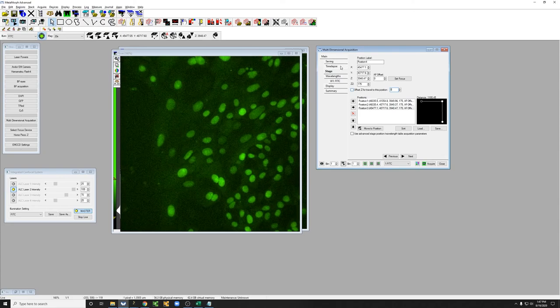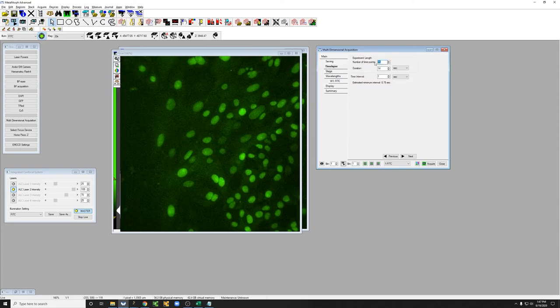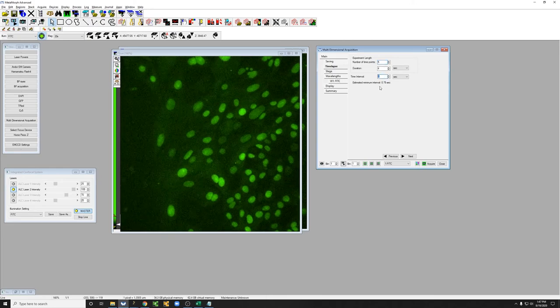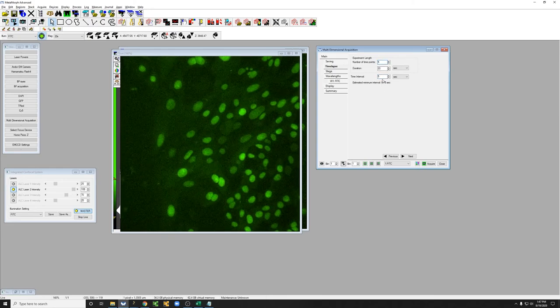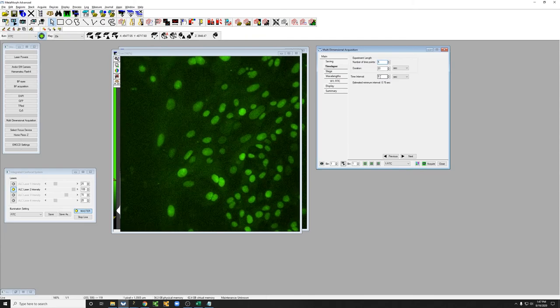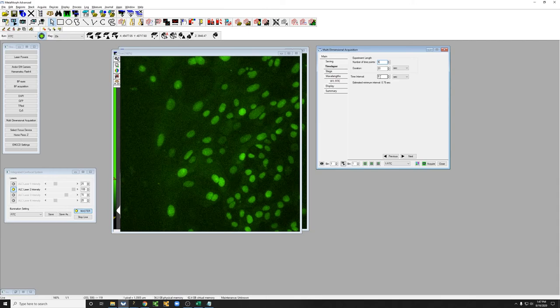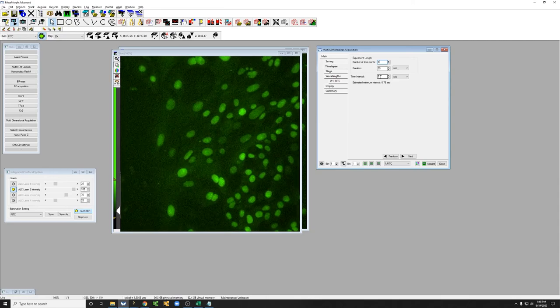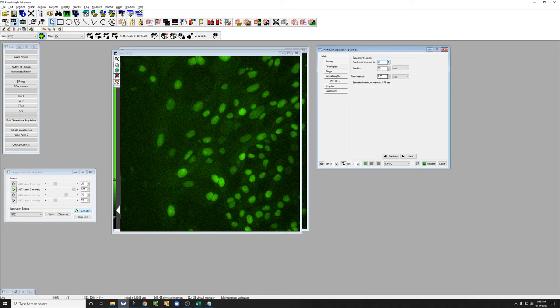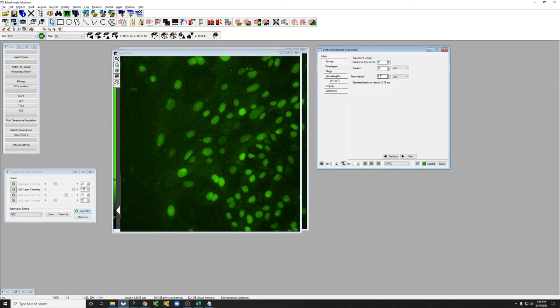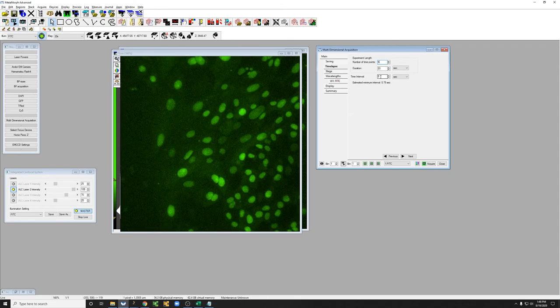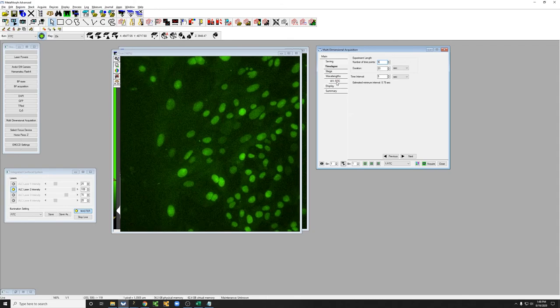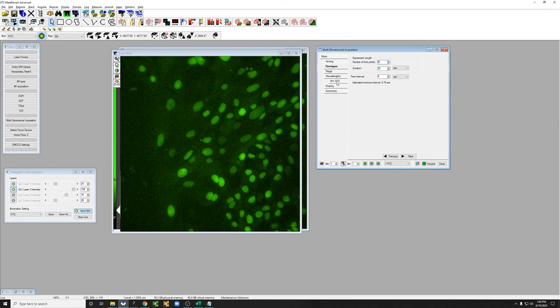And I'm going to modify the time lapse. I'm just going to do five points and I'm going to have a five second interval between them. Again, if this interval is less than the time it actually takes the system to acquire, it'll just go as fast as it can. But if you want precise timing, sort of a precise sense of what the timing is, it's a good idea to check this and make sure that the interval is enough to let the microscope go to every position in every channel. In this case, there's only one channel, but if you have more than one, it obviously takes more time.